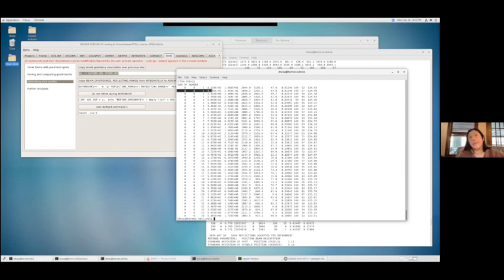So yes, the XDS ASCII is the file that's the same as the .sca file that comes out of HKL 2000, but we're actually going to do some more processing on these files and turn them into MTZs before we would take it on to Phoenix or any other. So we're going to add FreeR flags, and I'm also going to go over what the different columns mean. I hope there'll be time on Wednesday so that we can understand those files better.